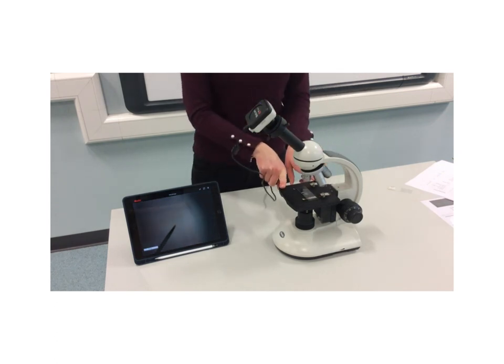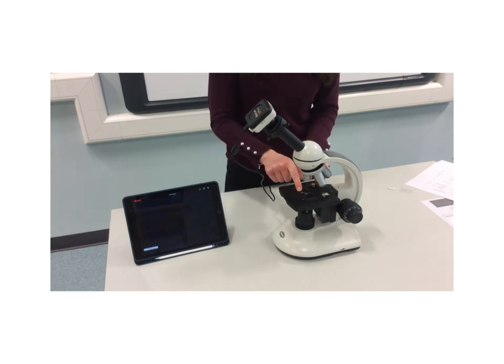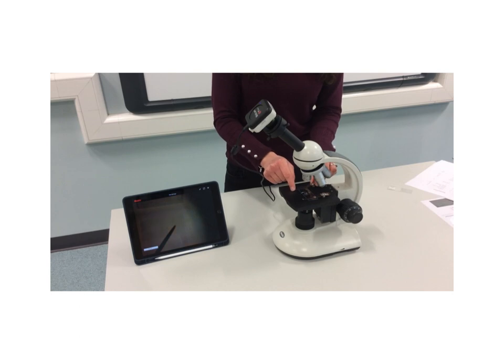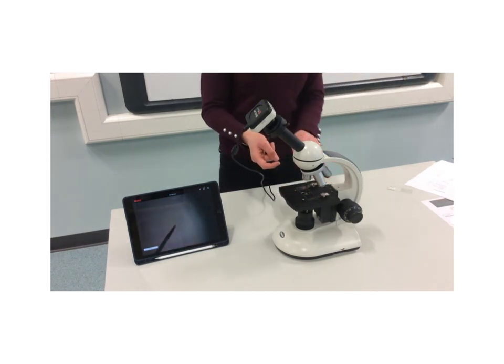This is the stage, so it's where I put my slide, the sample that I want to view. And you can see here I've got a little slide on my stage ready to go. And these are simply called the clips. These are the clips, and they hold the slide in place.